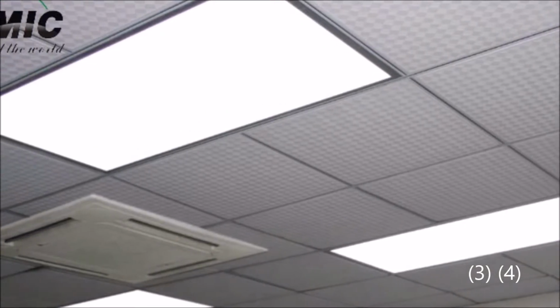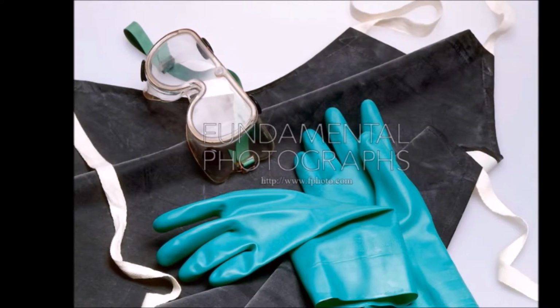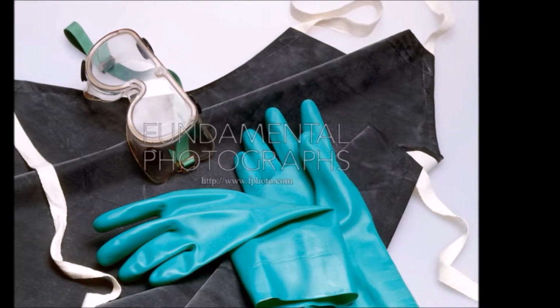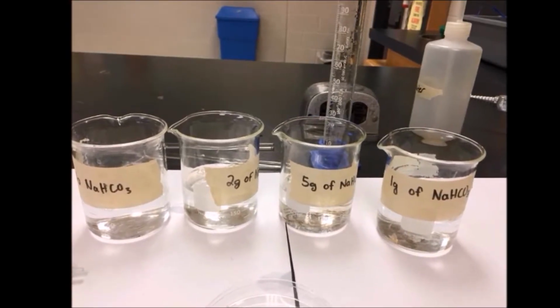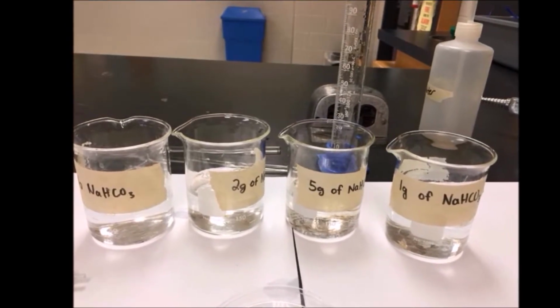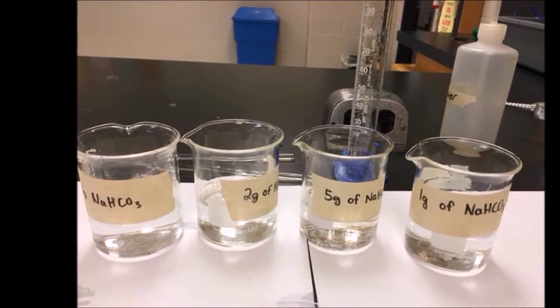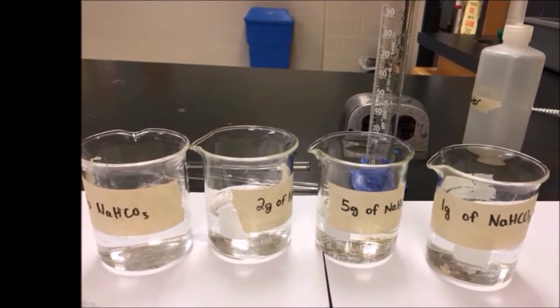Prepare the lab station in a room where there are ceiling lights. This will be the light source in your experiment. Obtain all materials and apparatus, and wear necessary safety equipment, including an apron and safety goggles. Label the beakers appropriately. 4 200 ml beakers should be labeled as 1 gram, 2 grams, 5 grams, and 0 grams of sodium bicarbonate respectively. The 5th 200 ml beaker should be labeled as diluted soap solution.